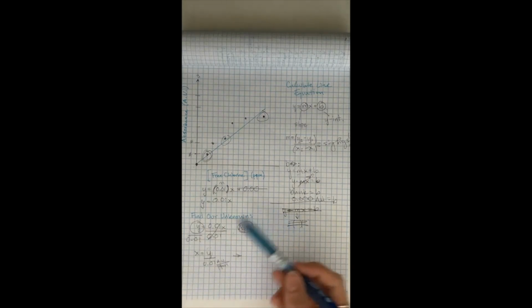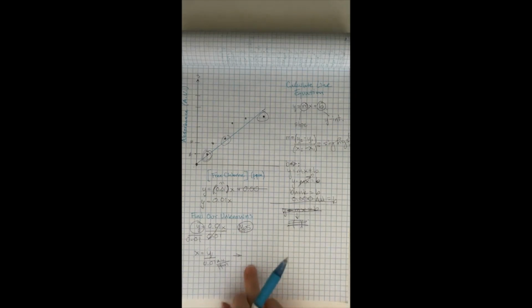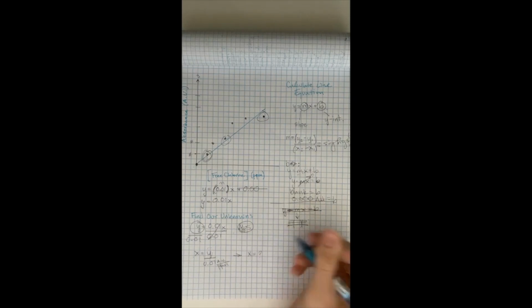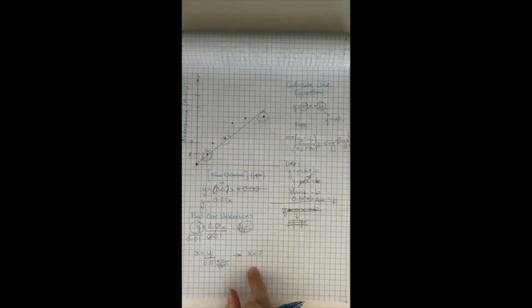So that's essentially your calculation sections. Then once you have this, you're going to get some answer x, right? And then on some slide, or in the raw data, we are going to tell you what the identities of the unknowns are, and then you need to compare those to the actual values, or the theoretical values, and compute your percent error, which you should know by now how to do. If you have any questions, just reach out to your instructor.